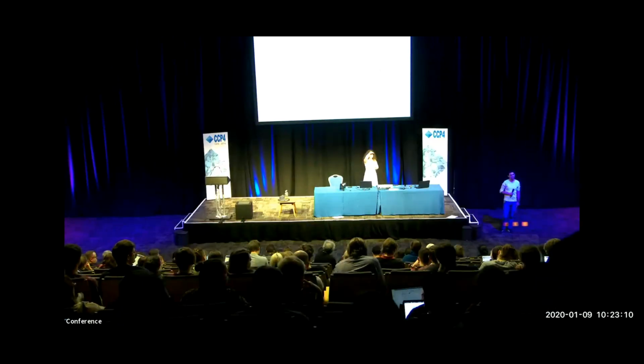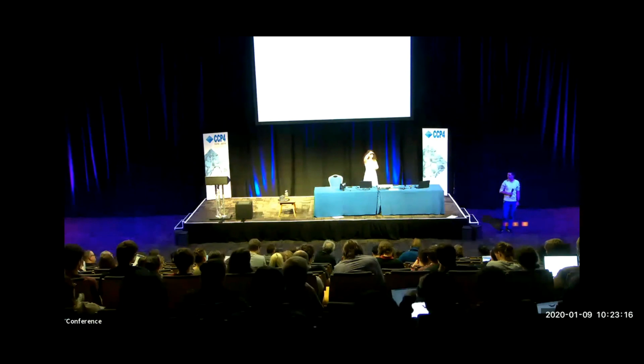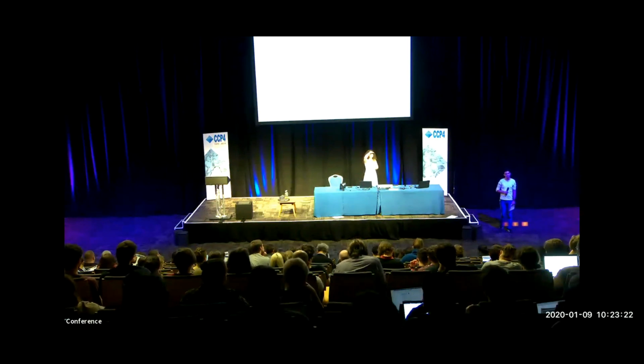And that gives stability problems in the optimization. So Bob used only a 10 residue molten zone, which of course can correct only local problems. But I'm sure that nowadays with the optimizers we have, much more can be done. So good luck. Thank you.